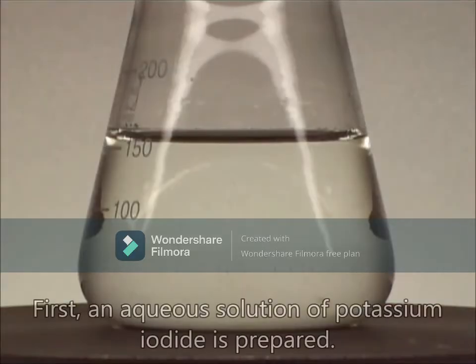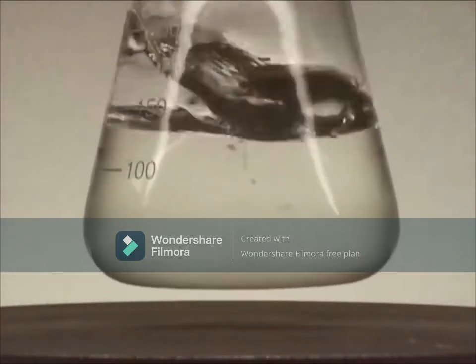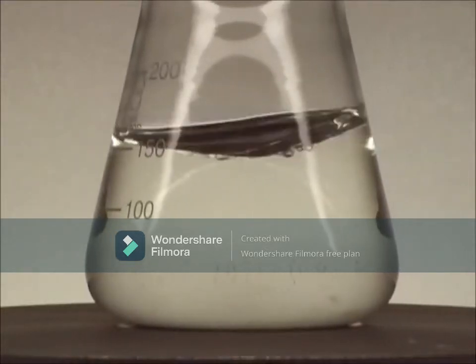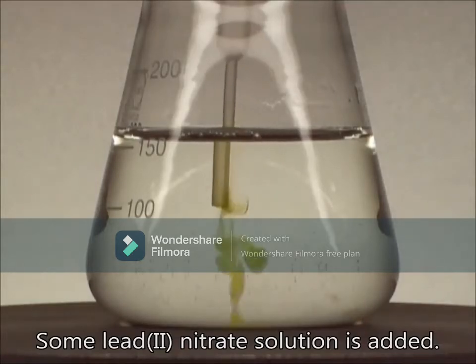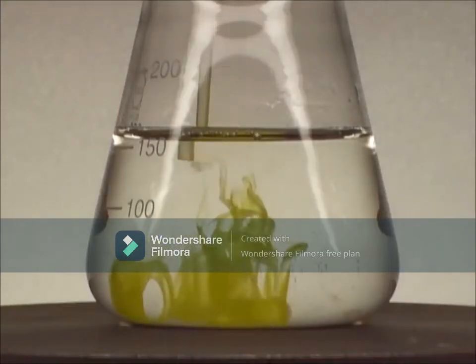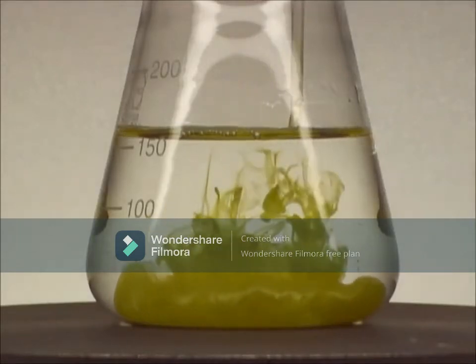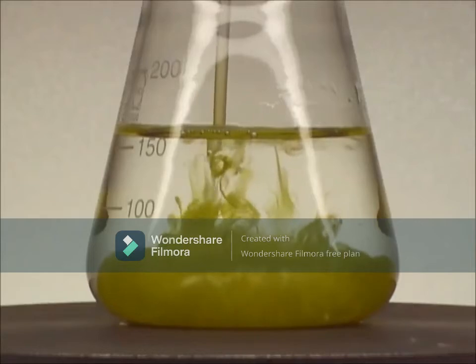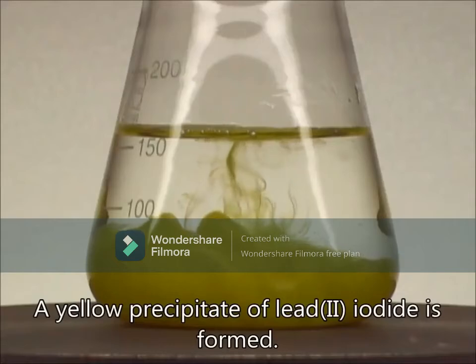In the first experiment, we are going to create a golden rain. To start, an aqueous solution of potassium iodide was prepared. It was a colorless solution. And then some lead-2 nitrate solution was added. As observed in the video, a yellow precipitate was formed. This is lead-2 iodide. The reaction is precipitation, involving two aqueous solutions that react to form a solid precipitate.